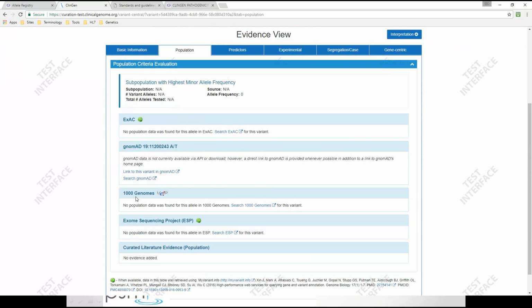It's never been seen before in the 1000 Genomes project. This is a variant that we've found in our patient, basically, where as far as we know, it's never been found anywhere else. Now, keep in mind, there's a lot of other websites out there that are keeping track of variants, and it's not as though this is really a comprehensive source, and I'm just kind of doing this for sake of illustration.